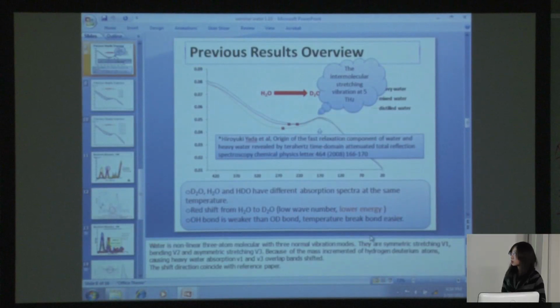And so now I want to try to compare with mid-infrared and near-infrared region, because in our laboratory we have the whole range of the spectrum. So maybe previous research only did mid-infrared or near-infrared, but they didn't compare several different spectra at the same time. So we have the advantage.